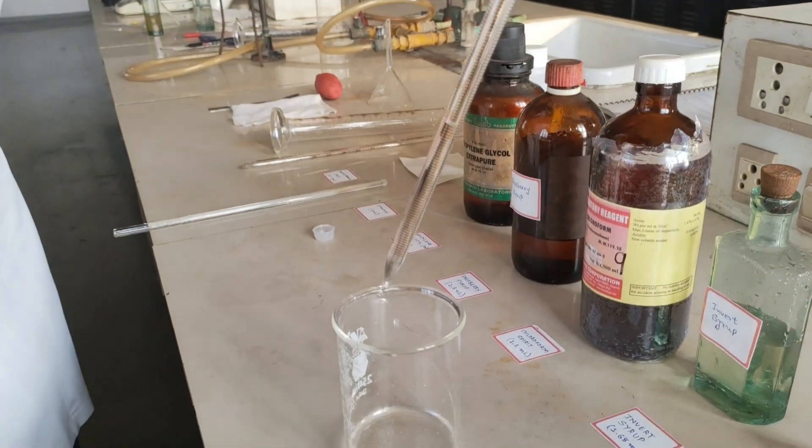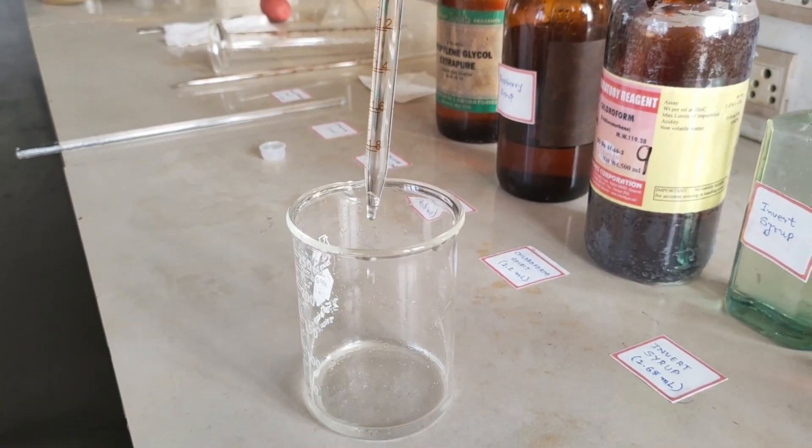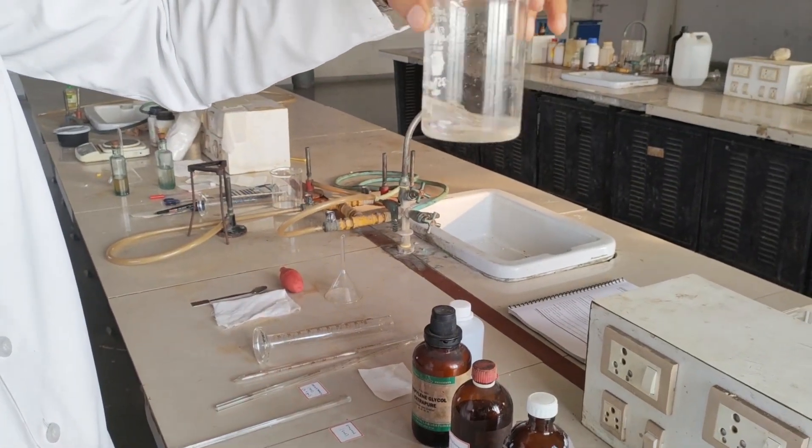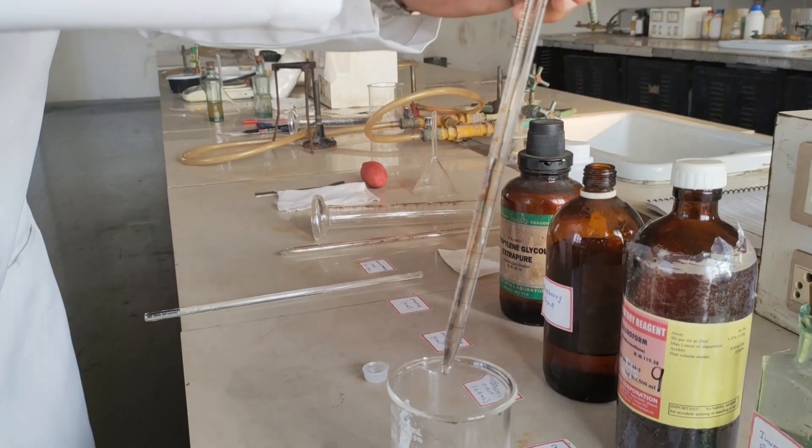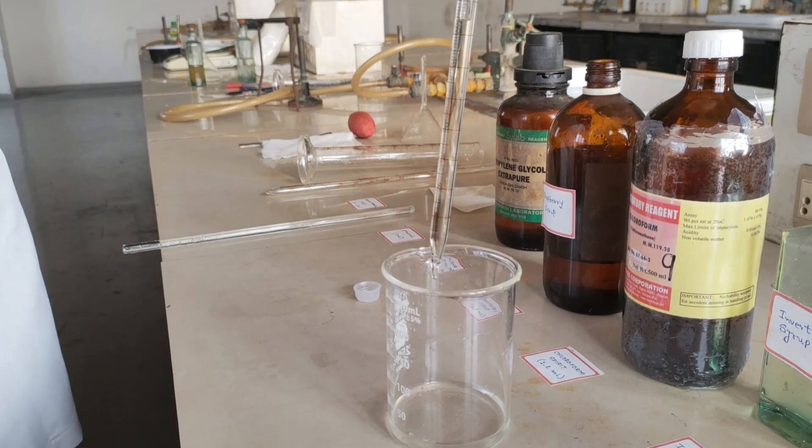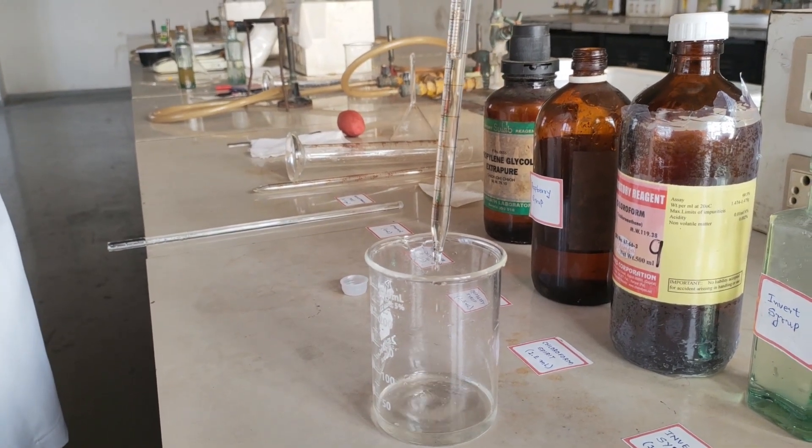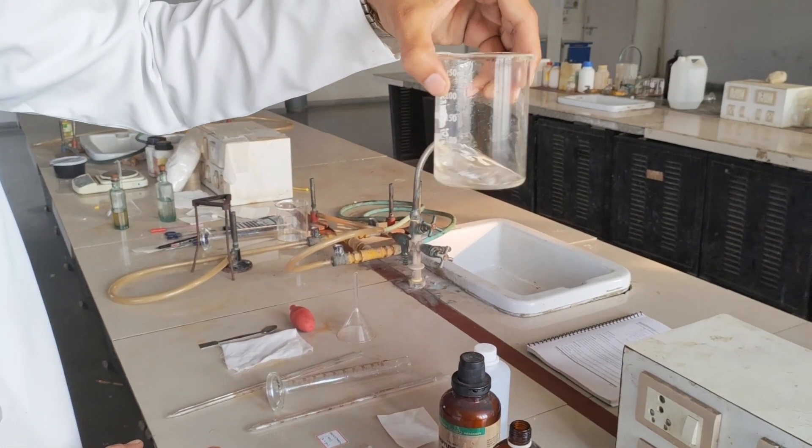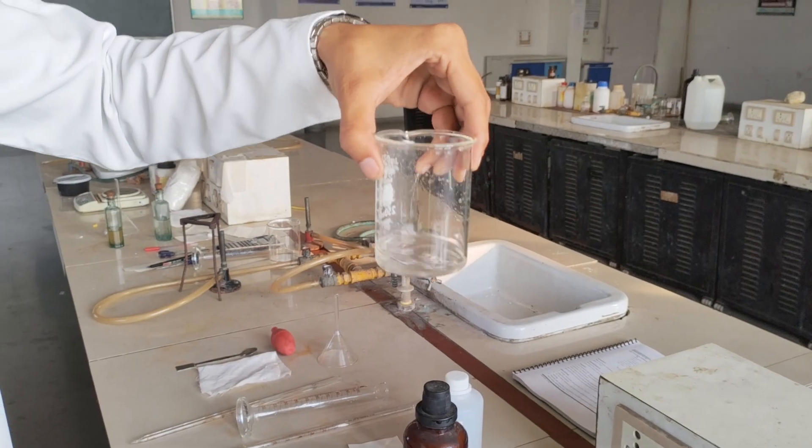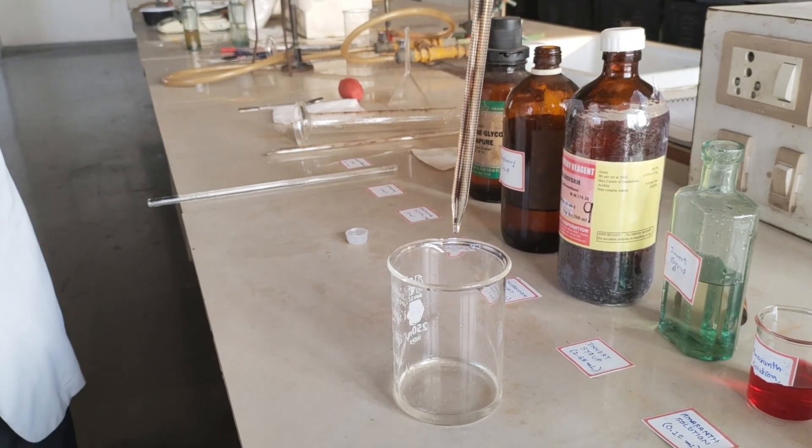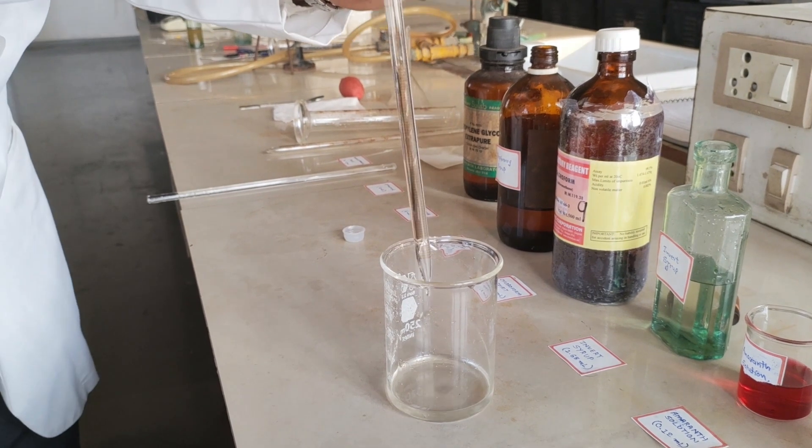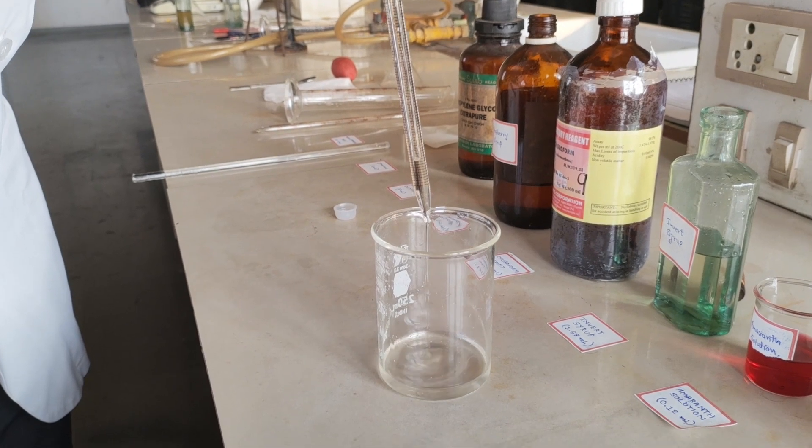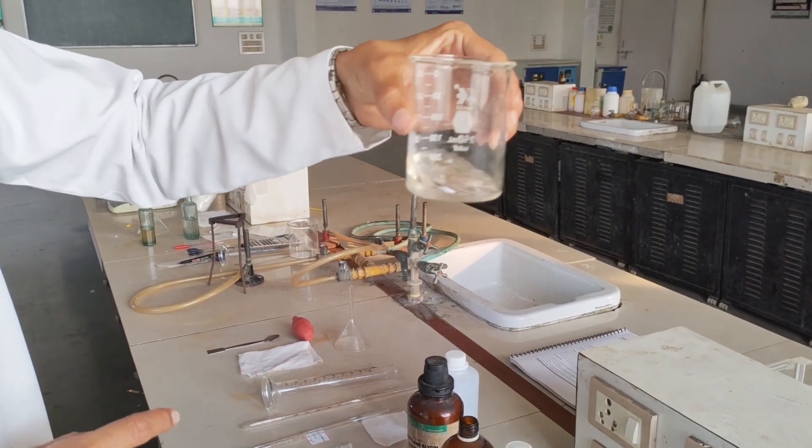Add chloroform spirit 1.2ml, mix it thoroughly. Now add raspberry syrup 1.5ml, mix it well. Now add 1.68ml of invert syrup. Mix it well after adding the invert syrup.